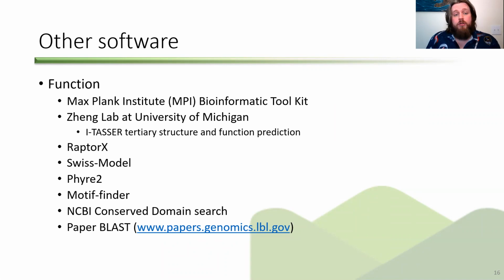Some other software you can use for functional annotation. This is more on the manual side of functional annotation. It really depends on what your phage is used for. If it's going to be a phage that's used a lot, something that may go into multiple patients or may go into a lot of research, it's recommended to go through and try to figure out what some of the hypothetical annotations are, because if you have a phage that isn't closely related to some of the more well-studied phages, it's not uncommon for 70% of the genes you annotate to be considered hypothetical genes or phage genes.